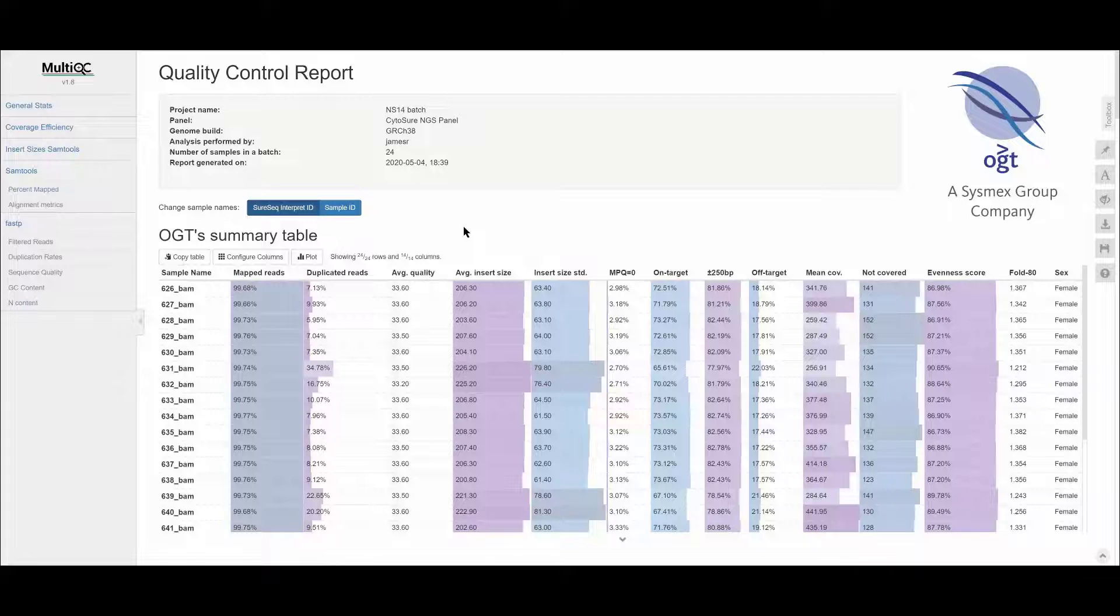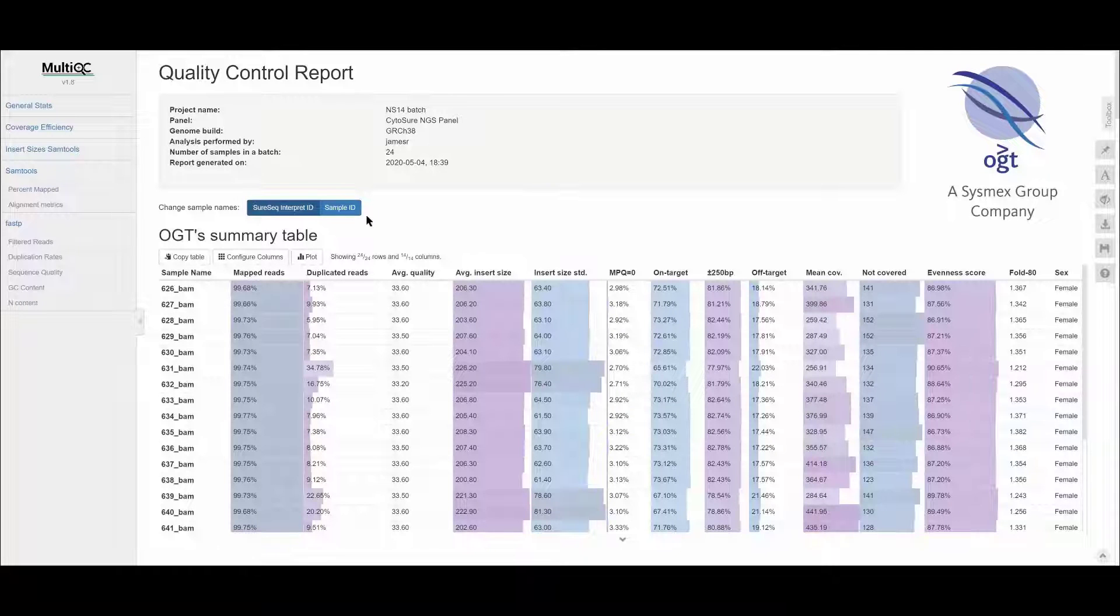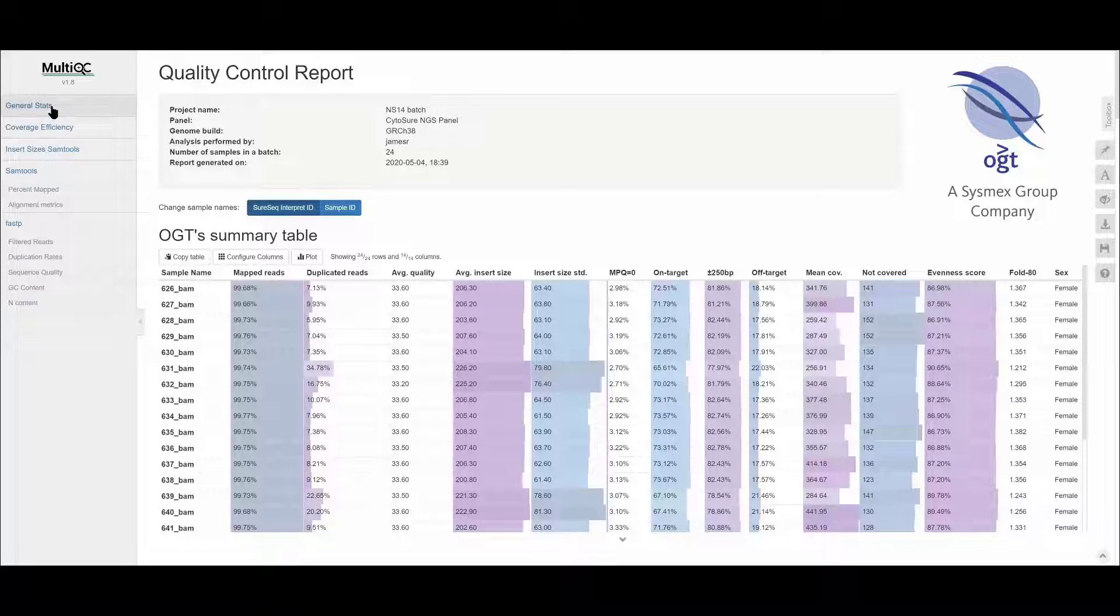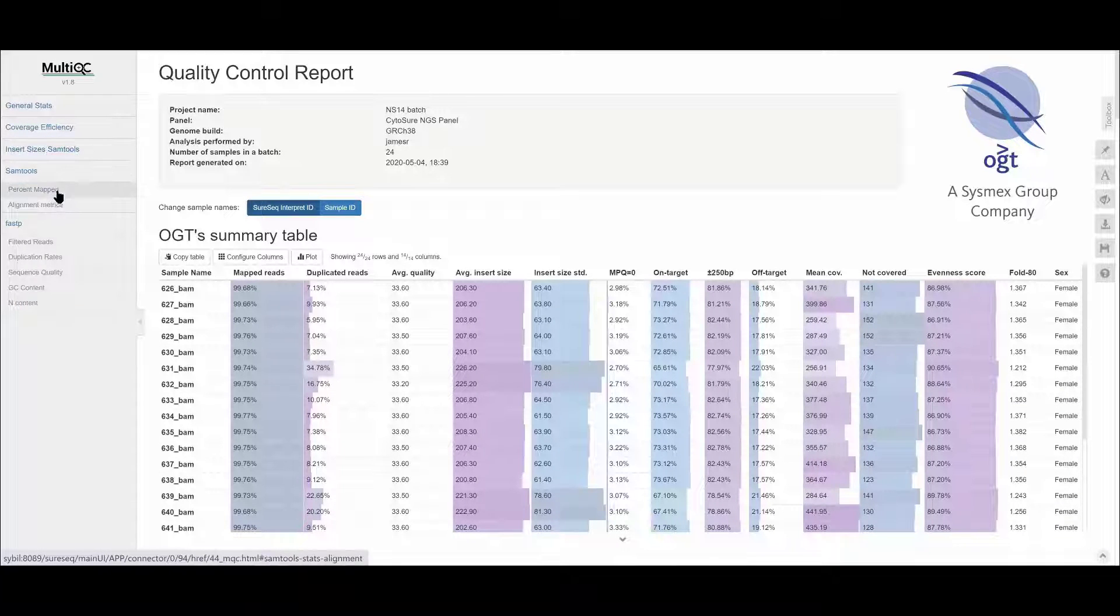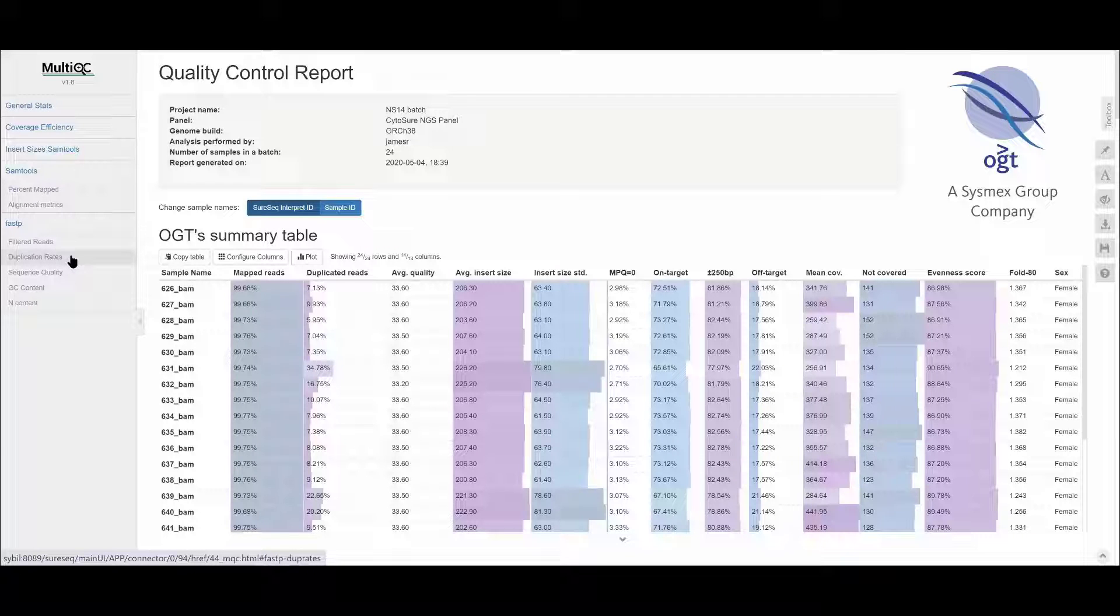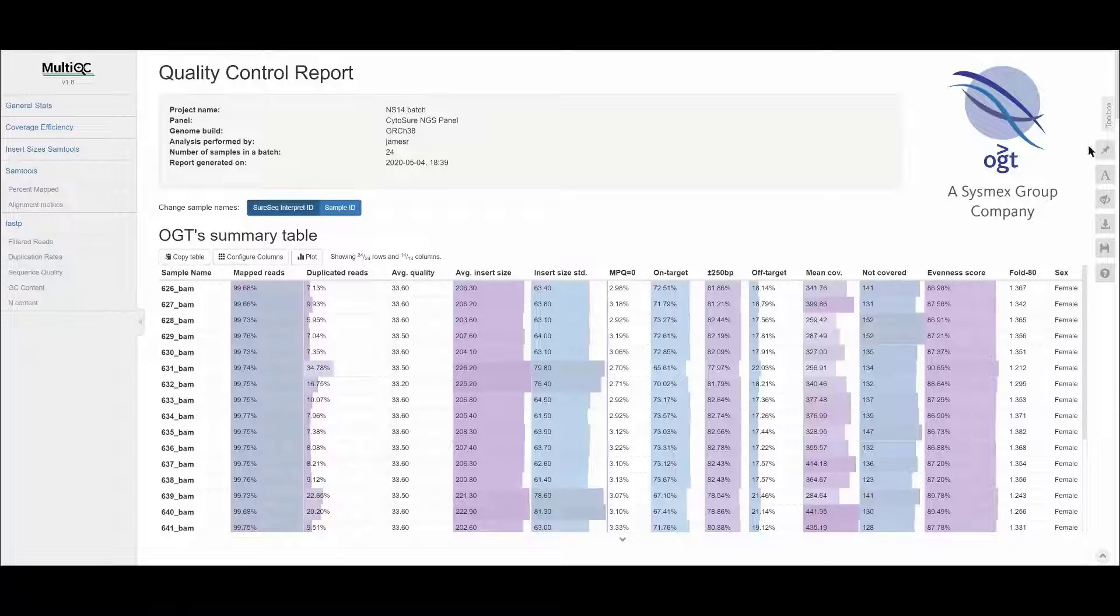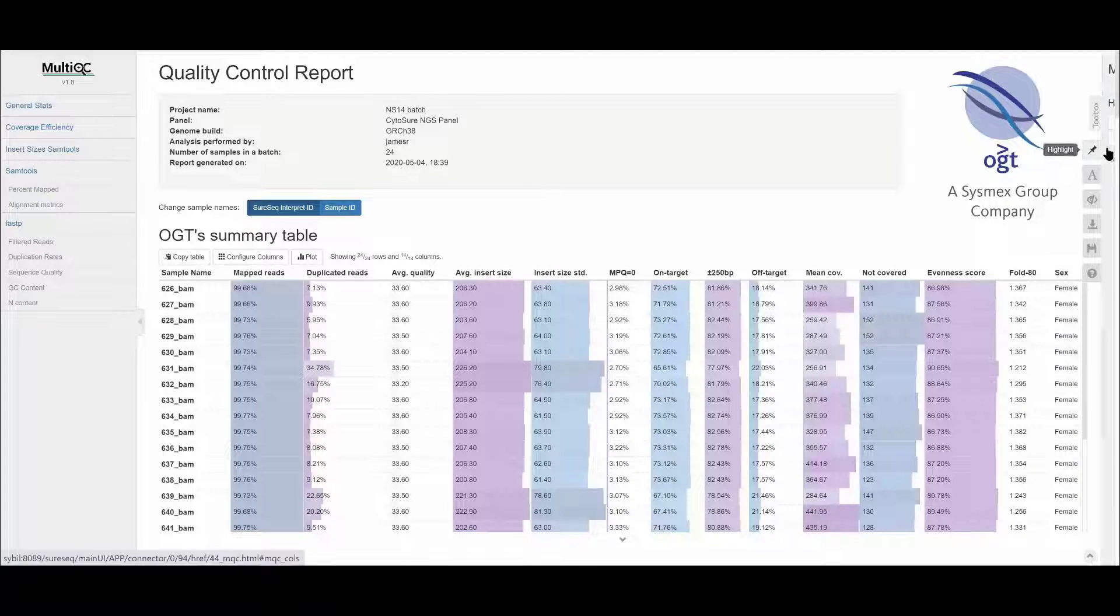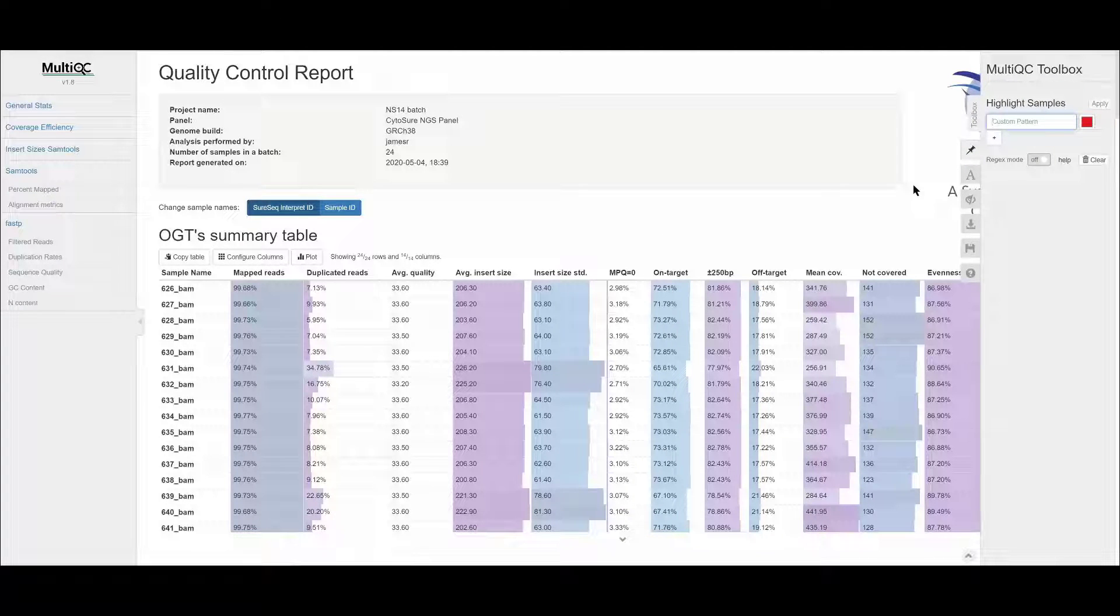There is a navigation bar on the left which you can use to go directly to different sections that have been generated by different bioinformatic tools used in the analysis pipeline. On the right hand side, there is a toolbox for accessing additional functions.